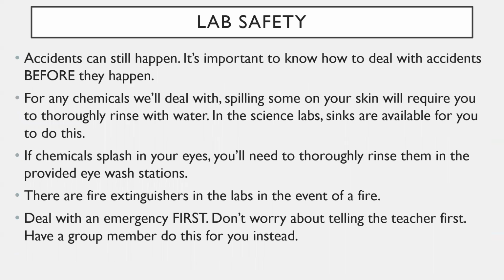Now, even with all this personal protective equipment, accidents can still happen. It's important to know how to deal with accidents before they actually happen, though, right? That's a huge part of lab safety. You have to be prepared for whatever could happen.